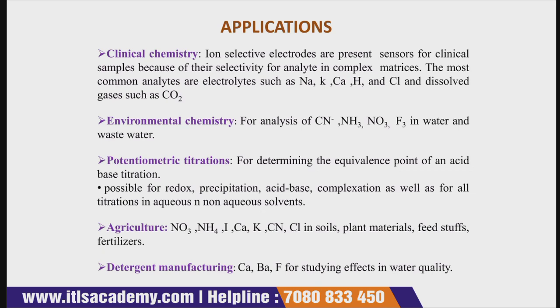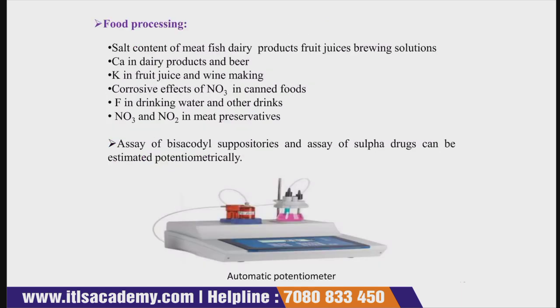Then it has a huge application in agriculture. Whenever you want to determine the calcium, potassium or chlorine present in the soil, plant material, feed stuff or fertilizer, this potentiometric method is widely used. Then in detergent manufacturing also it has a huge application.